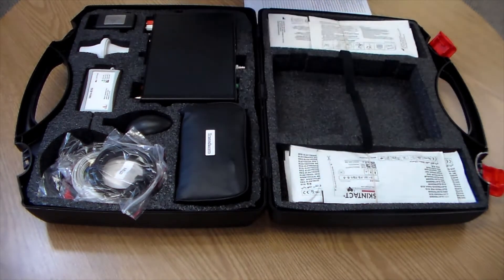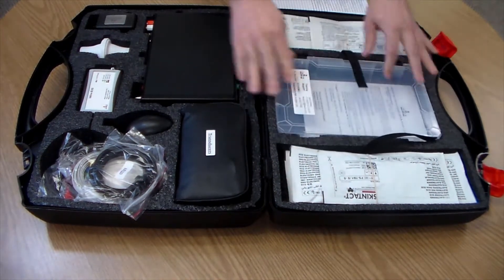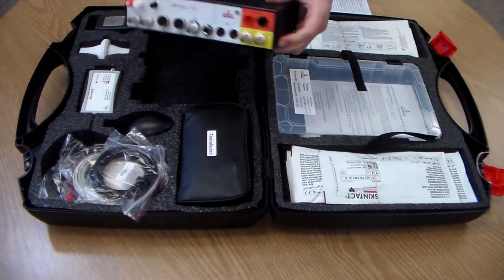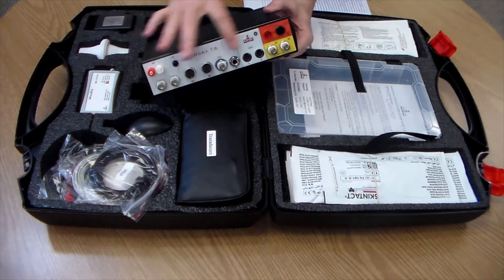The backbone of the system is the iWorks TA. This is where all your sensors will plug into. It connects to the computer with a USB cable.